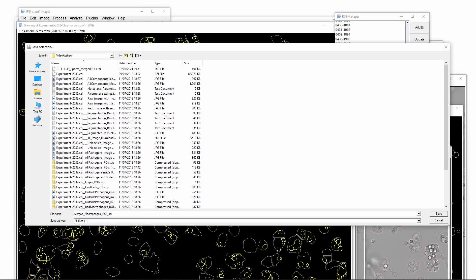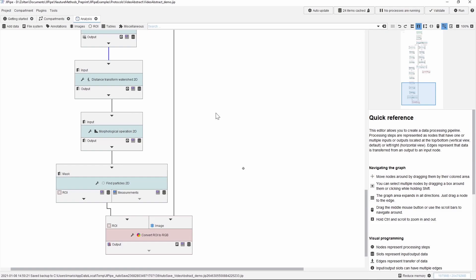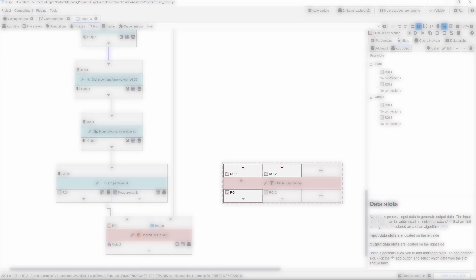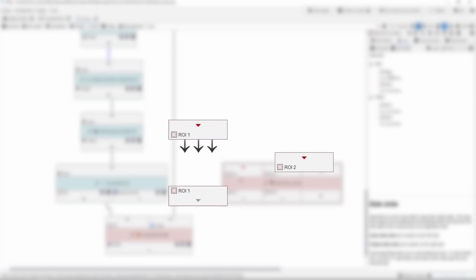Finally we demonstrate the region of interest comparison in Jipipe. Jipipe can also offer the same steps that we followed in ImageJ when comparing two sets of regions of interest. However we implemented a much more convenient node. This purpose-designed node is called filter ROI by overlap and it contains by default two inputs and two outputs. The output ROI1 will contain those input regions from ROI1 that overlap with at least one pixel in the ROI2 input. The same is of course also true for ROI2.